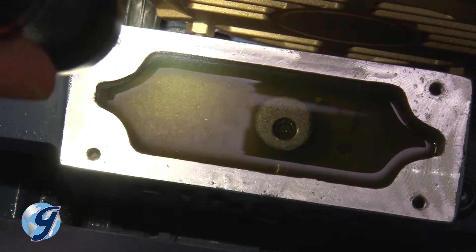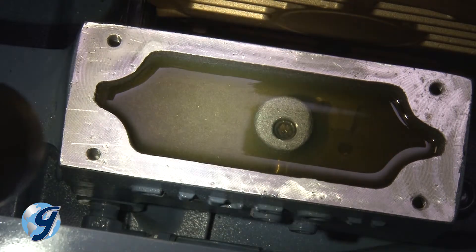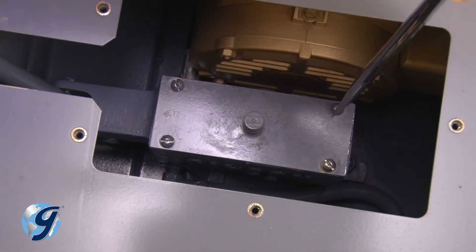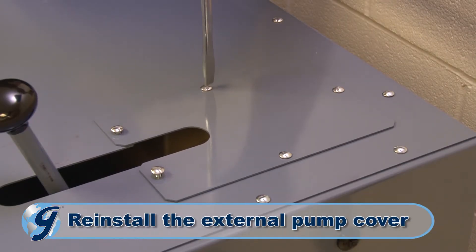Once you have confirmed the hydraulic oil is a quarter inch from the top of the oil reservoir, reinstall the pump cover assembly in the same orientation as it was before its removal. Now return the external pump cover to the top cover.